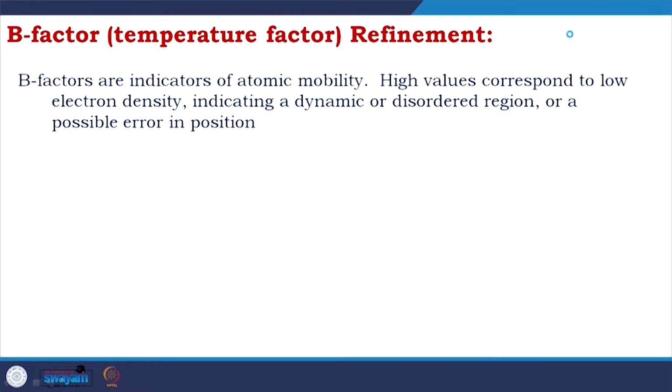Now, as in macromolecular crystallography or protein crystallography, we are dealing with a lot of things. So, unlike small molecule crystallography, it is very difficult to confirm which factor is actually influencing what. What I am trying to say? In general, if you consider B factor, high B factor says that there is flexibility or disorderliness in the structure, but it might also be corresponding to low electron density.